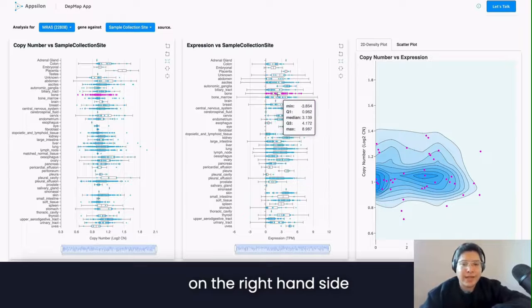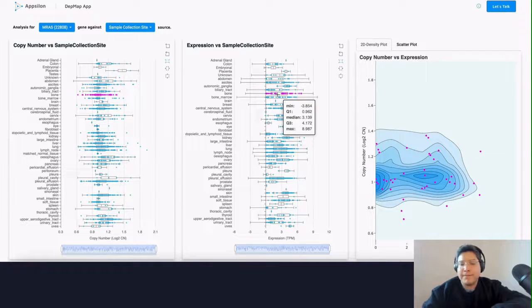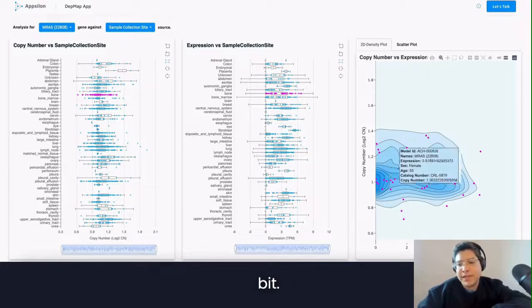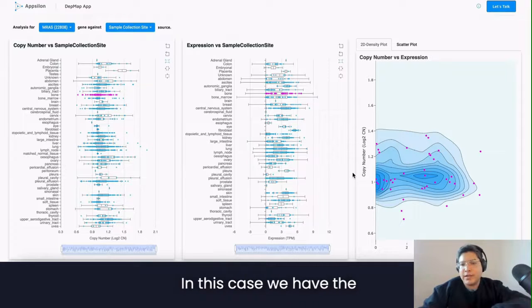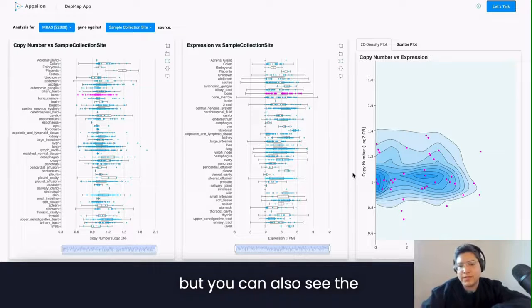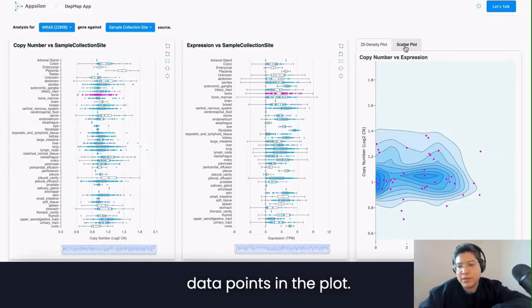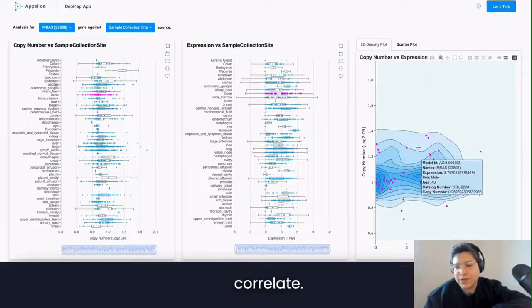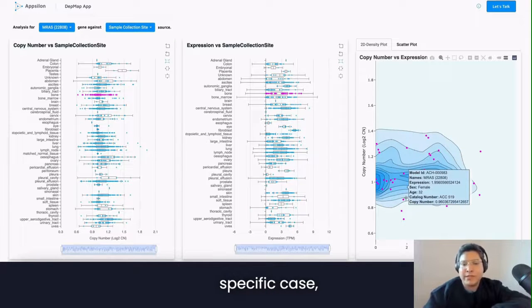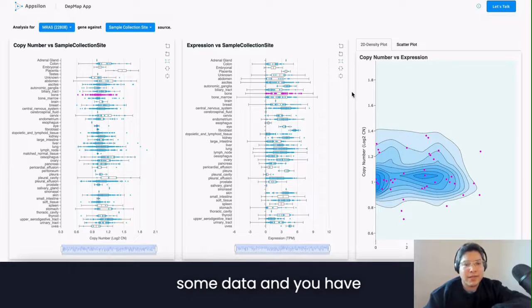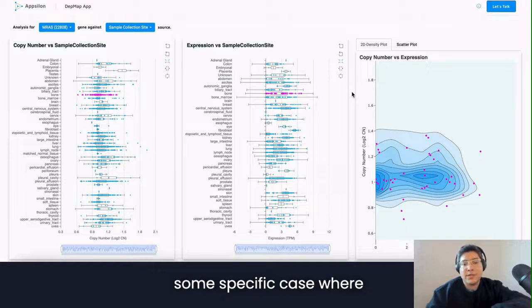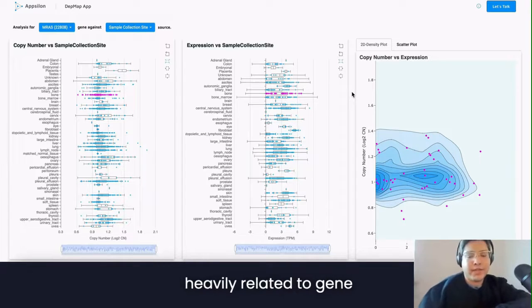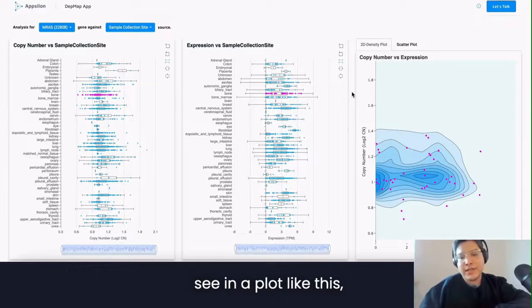On the right-hand side of the window, you can observe the plot I previously talked about. There are two ways to visualize it — in this case we have the 2D density plot, but you can also see the individual data points. You can see that the data is pretty sparse and it can be hard to correlate, but when you have a specific case where copy number variation is heavily related to gene expression, you can actually see that in a plot like this.